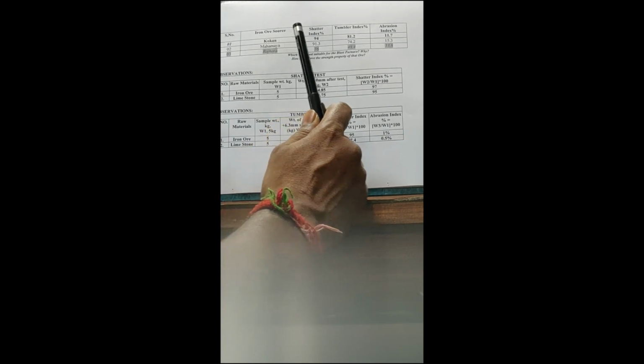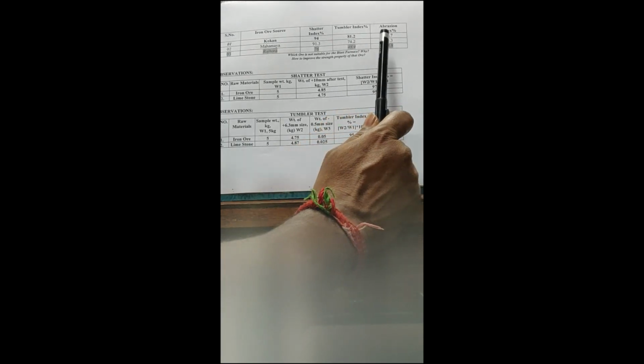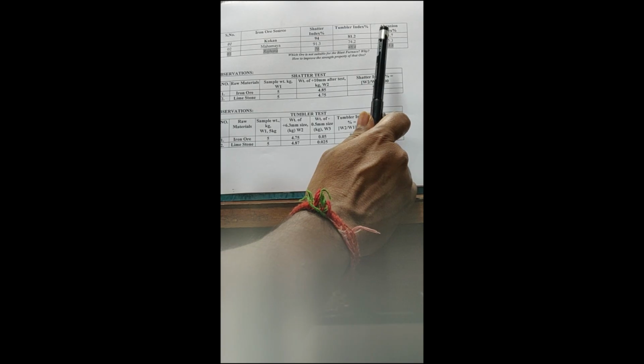If you observe clearly, Konkan has a shatter index of 94, tumbler index 81.2, abrasion 11.7. We need high values of shatter index and tumbler index, because these two indicate the resistance to impact. And we need less abrasion. We don't want to generate more fines, otherwise it will create a problem when you charge in the blast furnace.